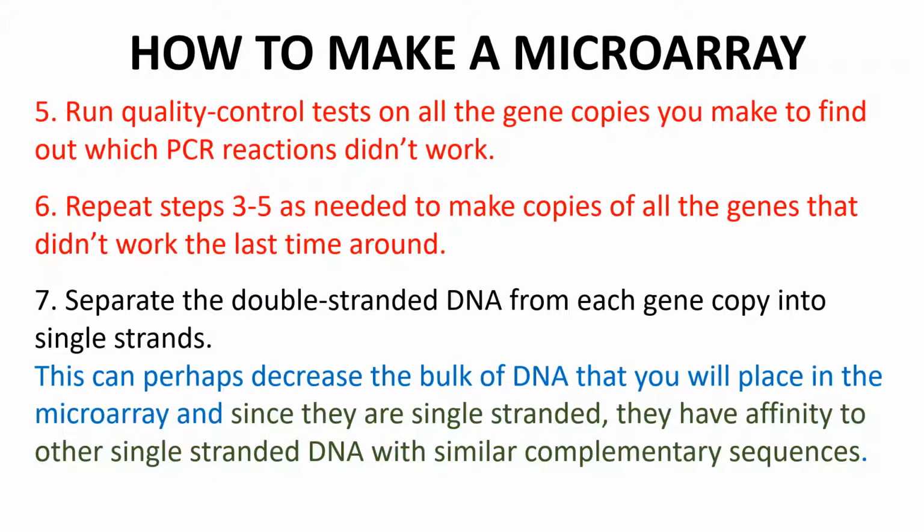Let's now go to step 7. Now, if all genes are ready, you must split them into single strands. Only single strands will be placed in the microarray. The microarray must be sticky so that our sample cDNA later can stick to its individual gene spots.